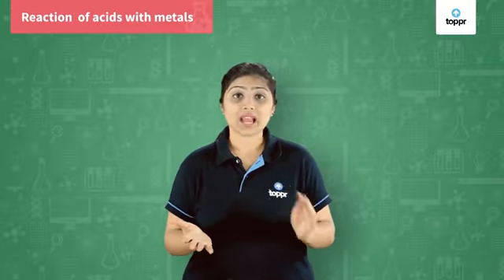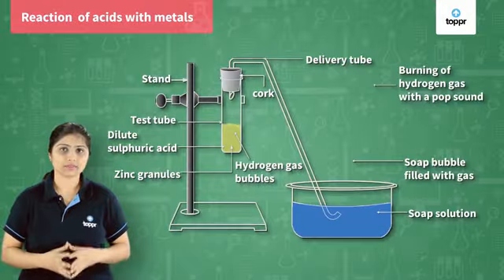Acids and bases. Let us see the chemistry between an acid and a base, and let us also see how acids and bases react with other elements and compounds around them. Let's begin seeing how acids react with metals. For that, we do one activity.